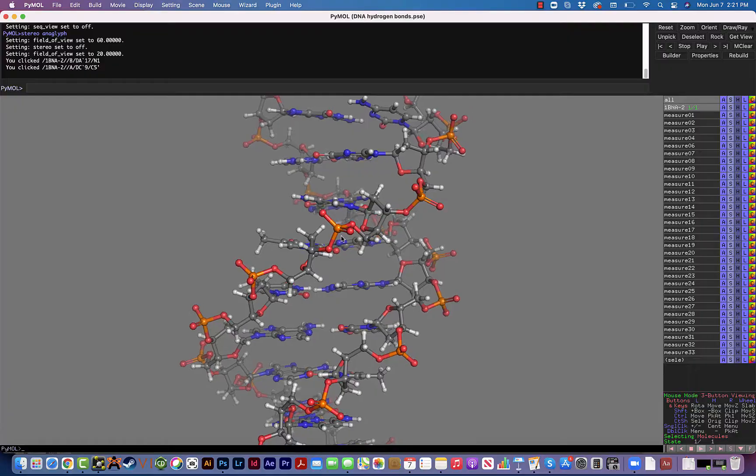Hi everyone. Did you know that Pymol could be converted into a 3D viewer using these stylish 3D glasses? Well, in this video I'm going to show you how to do it.